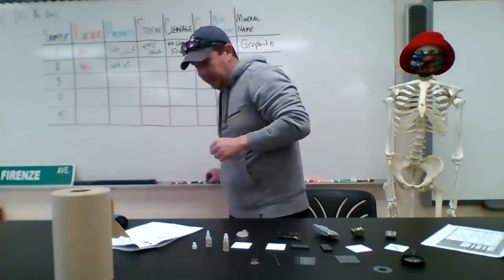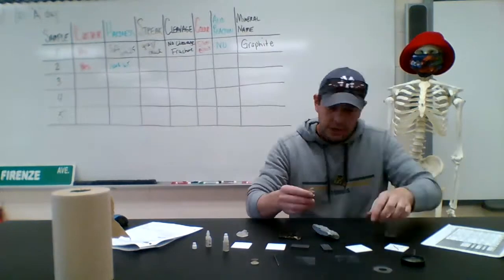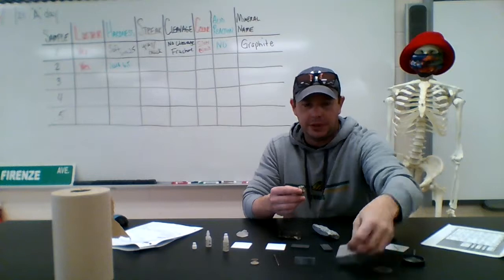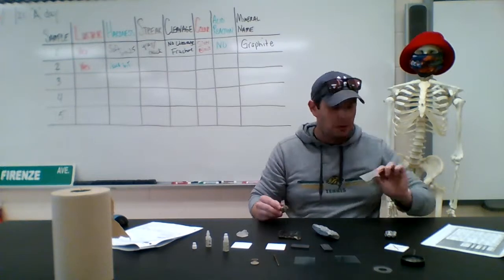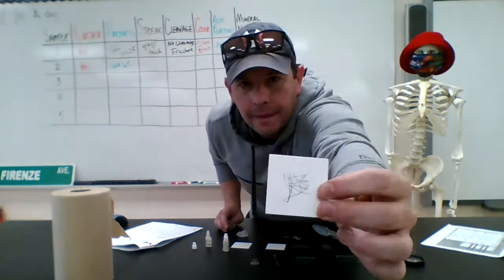Streak color. Let's take a look. All right, I'm going to take my white streak plate here. I'll put it up. Where can you guys see it? I guess there is fine. I'm going to try scraping it. Look at that. Huh, I wasn't expecting that.